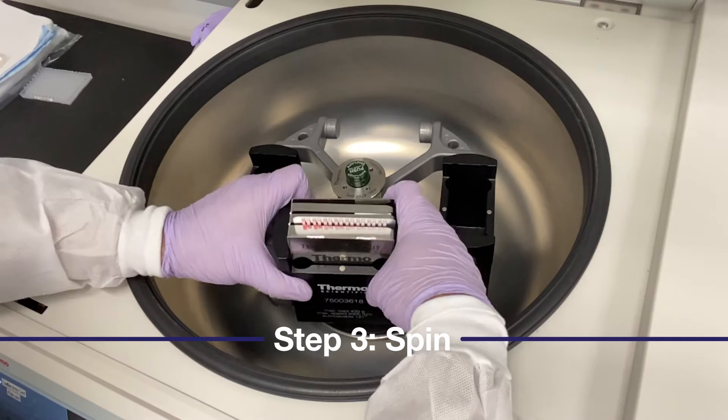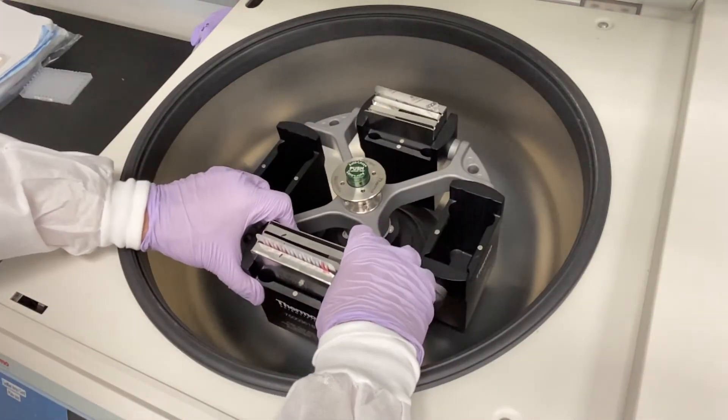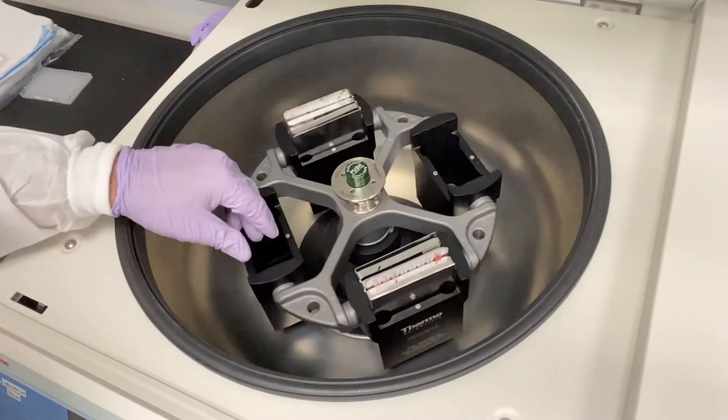Next, we'll be centrifuging our card by doing two spins for one minute each. This will equally distribute the samples into all the reaction wells.